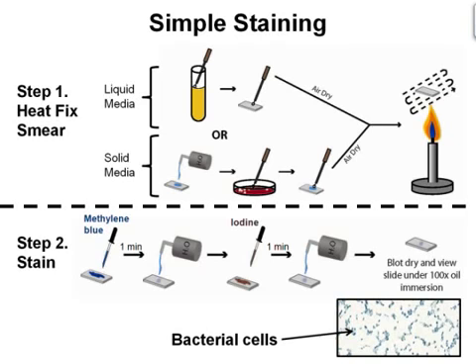Blot the slide using bibulous paper. It is important not to rub the slide, rather place the slide between 2 sheets of bibulous paper and press down gently. This will preserve the organisms on the slide and the paper will absorb any excess dyes.